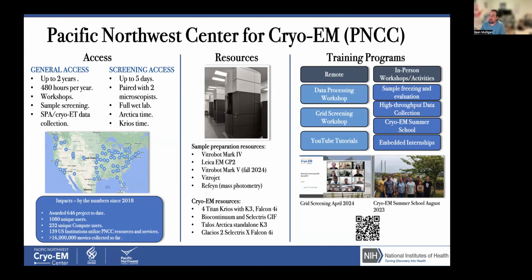Approved general access proposals are also eligible for our training workshops, which cover topics from sample preparation through data processing. Approved proposals are also assigned a scientific point of contact, or SPOC, such as myself, who can help you with questions about sample optimization, data collection strategies, and so on.